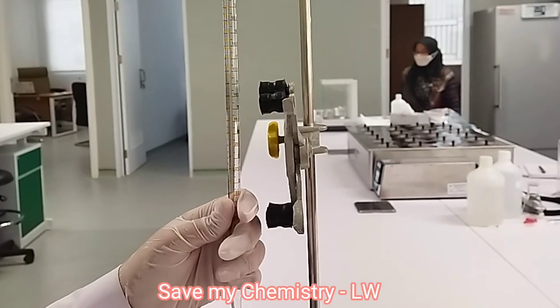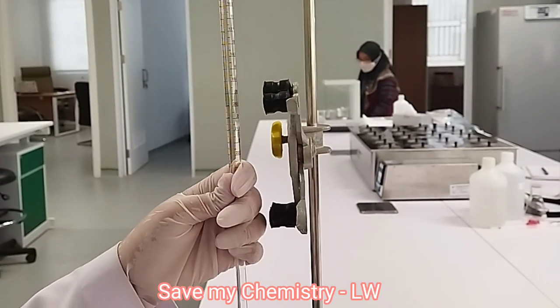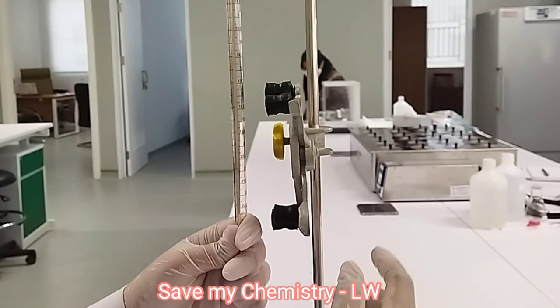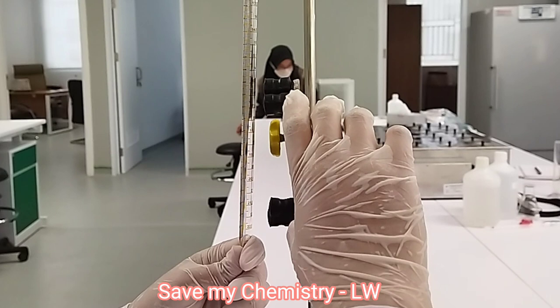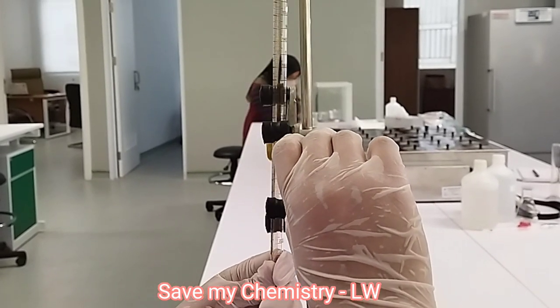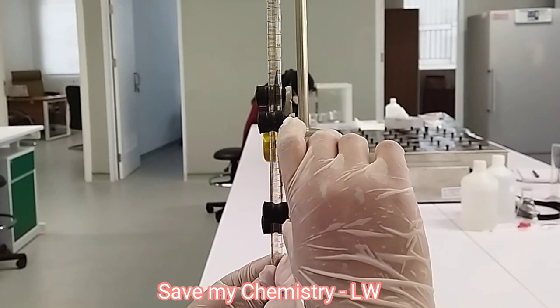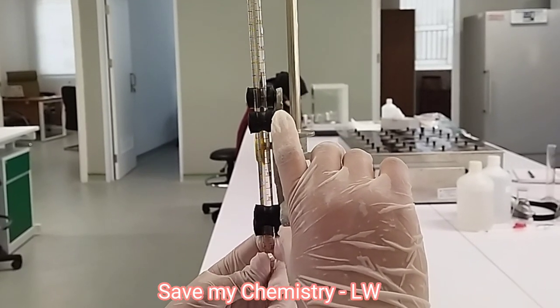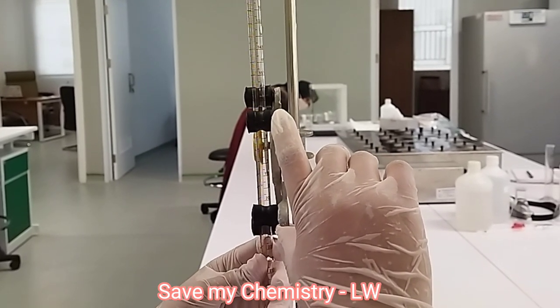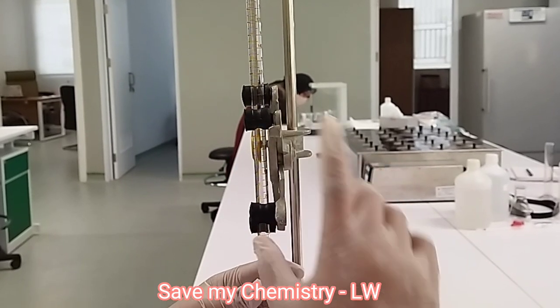How to use a burette clamp? You should fix the burette clamp on a stand. Squeeze the handle, and the rubber knobs will separate from each other. The burette will then be put between the rubber knobs.